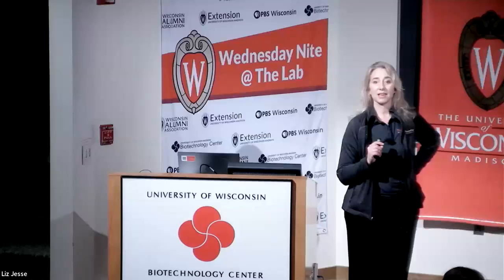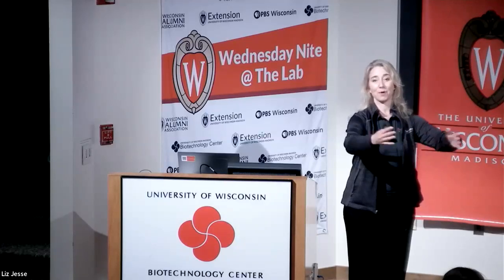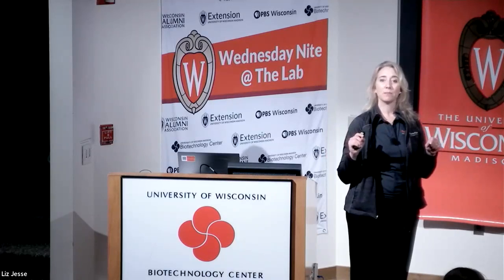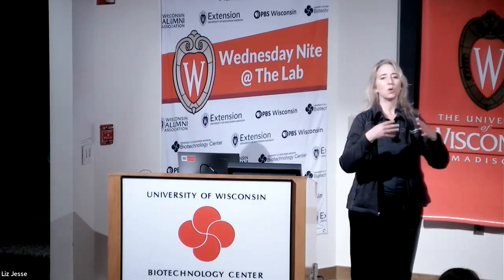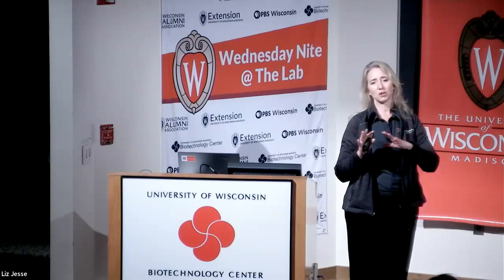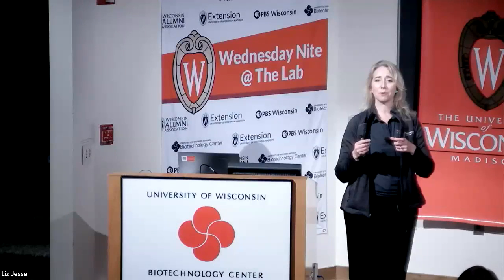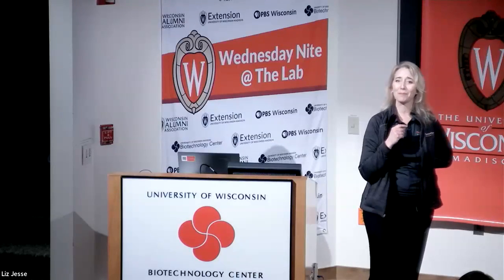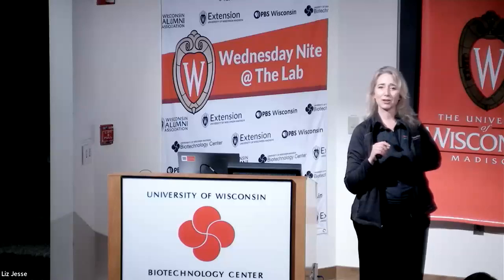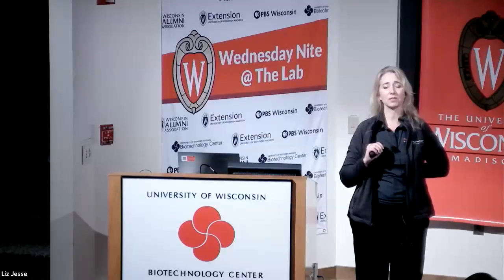And so here's the deal. This comes back to my example of toddlers in a sandbox. You're basically spreading them all out so they have their own sandbox, so your different targets will probably fall into different wells. But the trick now is to give them as many toys as they need to play with. So in qPCR, I didn't mention it earlier, but if you have 4 toddlers in the sandbox, how do you get them to play nice? Well, we actually tend to tie one arm behind their back by primer limiting. We don't give them as many toys to play with. And so your high expressers will go up, but then they'll have to cut off early so that all of the other ones have enough materials to play with.